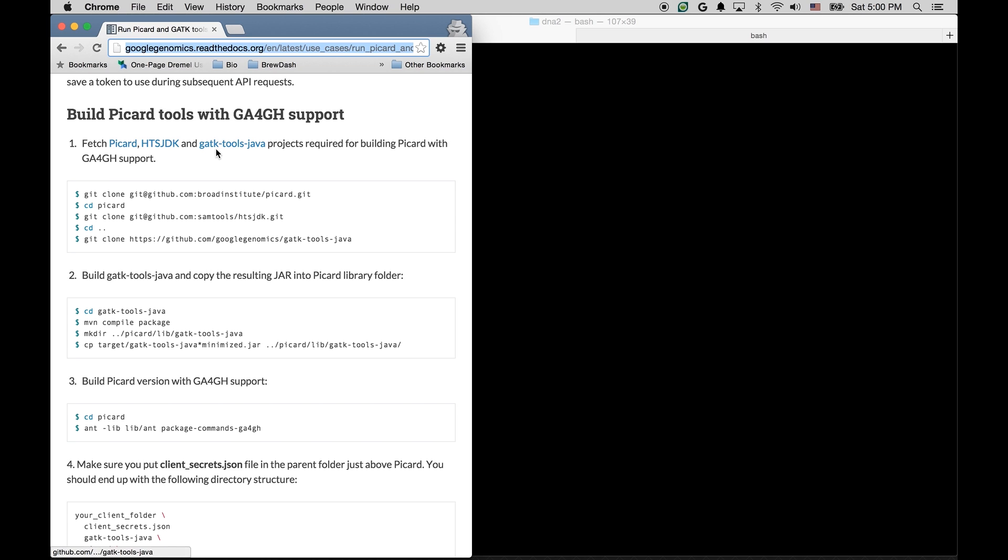And then finally, GATK tools Java library that contains the bulk of the logic for actually working with the API. Again, I will skip these steps since I have already done them on my machine.